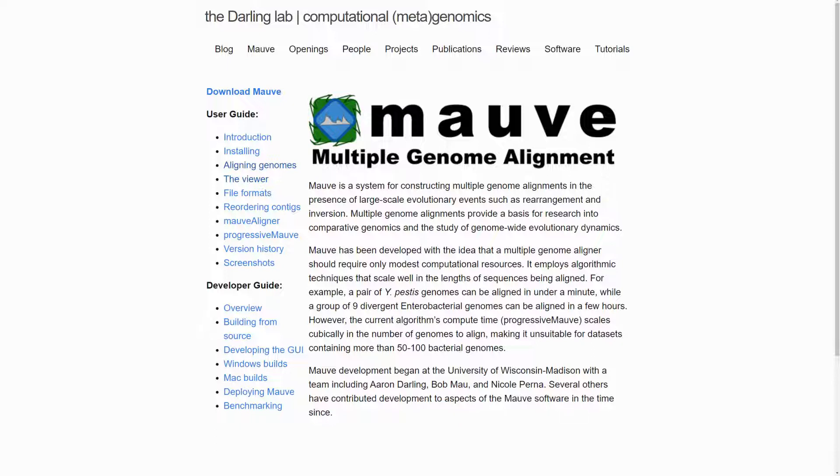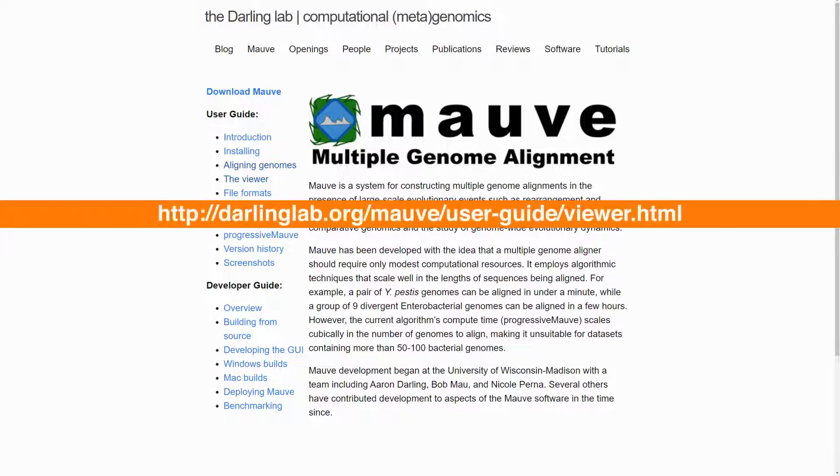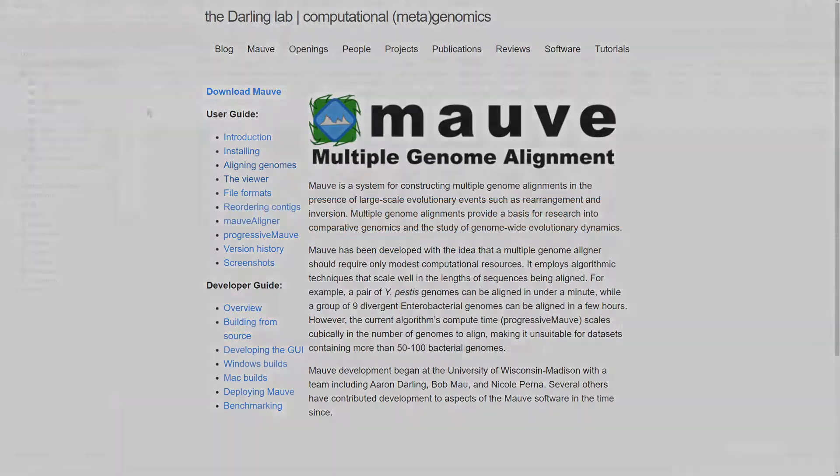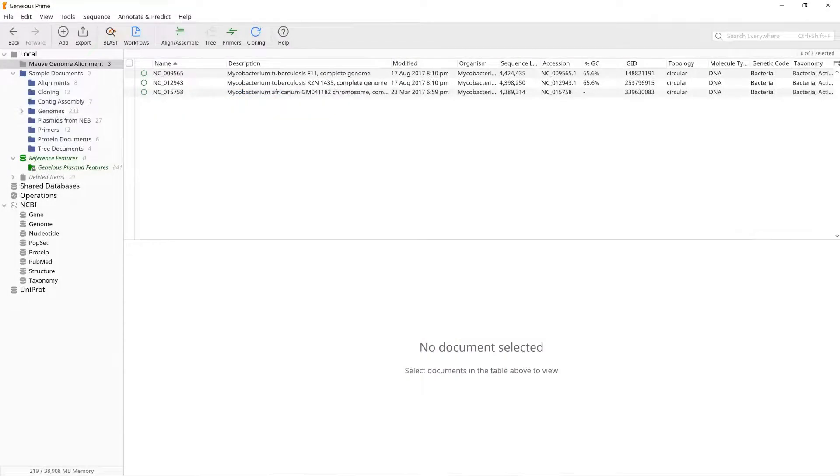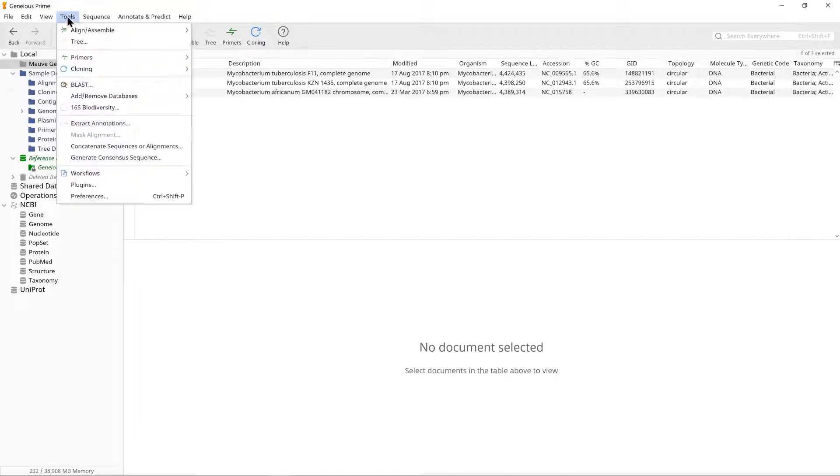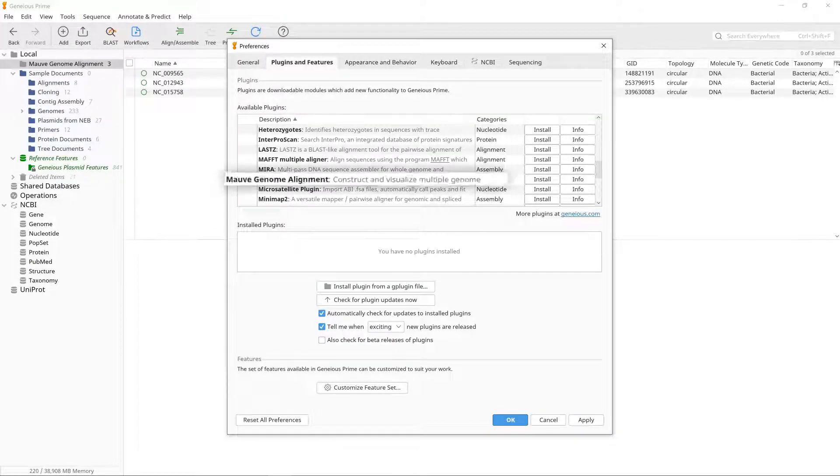For further information about MOV, including a full user guide, please see the MOV website. This analysis uses the free MOV plugin available from the Plugins menu in Genius.